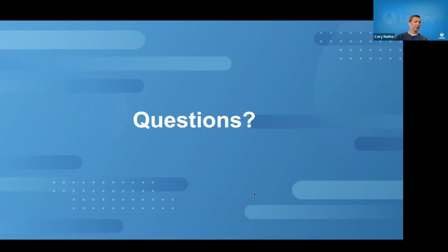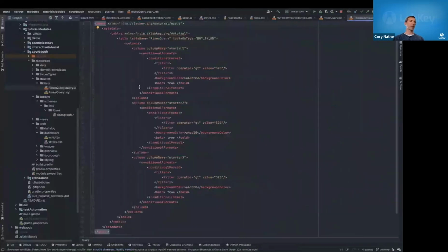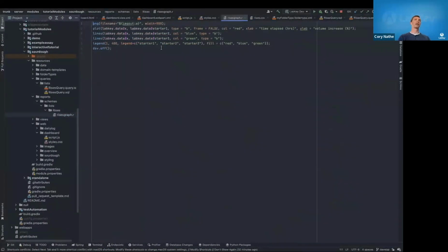Another question that I've commonly heard related to file-based modules is, if you want to pull up IntelliJ, maybe Rosalind, and pull up the R script that you had, how do I line things up correctly so they attach to, while we're talking about data structures, the right queries or tables when I'm using the file structure like this. As Rosalind mentioned at the beginning when going over the file module structure, under resources there, if we look at this R report as an example, the names of the subdirectories are very important and are mentioned in the docs page as well.